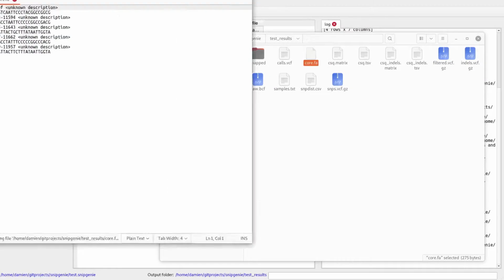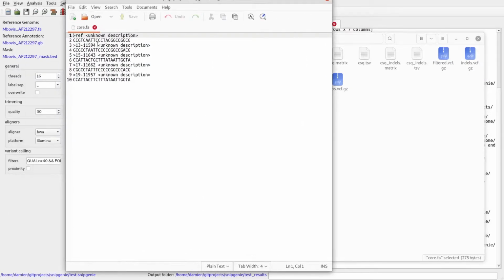If you have a quick look at this file, it's simply a FASTA file for each sample with the nucleotides at each position, matching positions. So it's like an alignment where SNPs were called. This is what distinguishes each sample for only those positions where SNPs were called. That's why these were selected out of the entire genome.